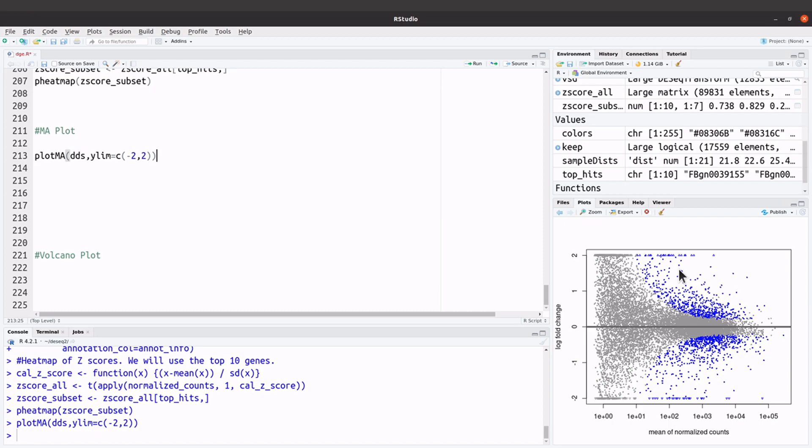DESeq2 by default uses 0.1, but it's possible to change this value. Just check the DESeq2 documentation and you'll be able to learn how to do that. You can also contact me and I'll try to help.